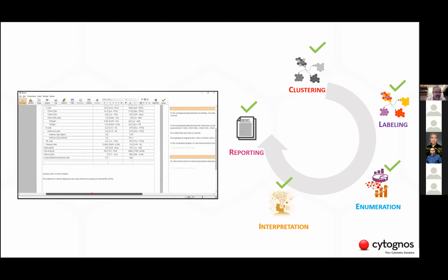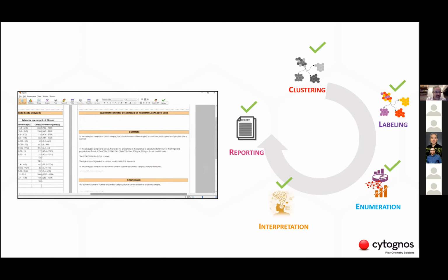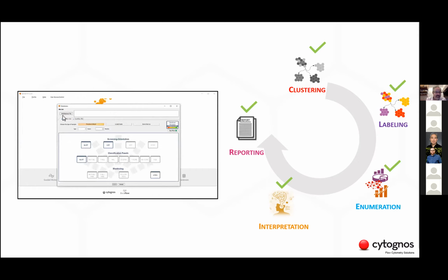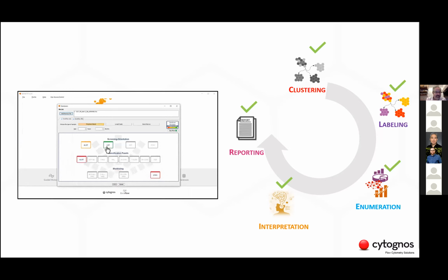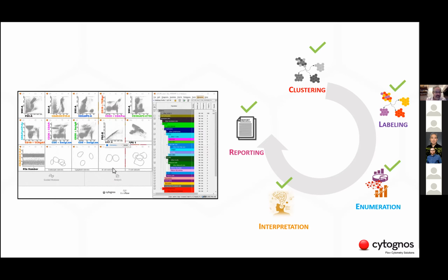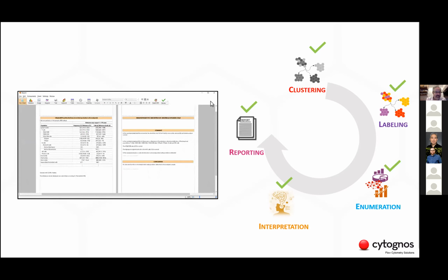And we can even automate the generation of the final report with reference values to create the phrasing for the clinician, things like that. However, this kind of workflow is only possible when we can employ a high level of standardization. That's why it was well received in a clinical setting.